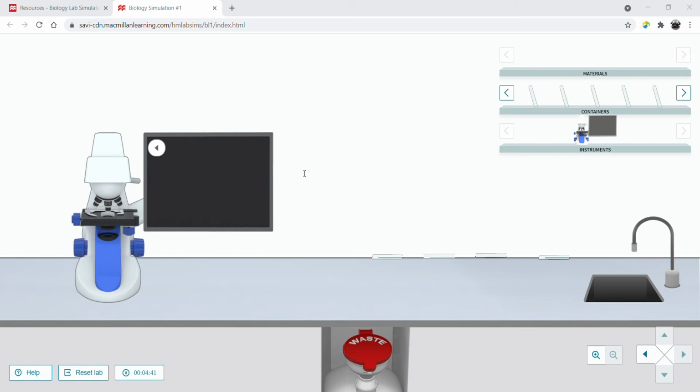Now, I'm going to go ahead and put the slides on the scope, and we'll look at the view screen to see what they have available to us. But the parts you are to label, and the images that I have of what we're supposed to look at through the virtual lab, are different. I got these off of Google Image because I wasn't able to put a screenshot of the virtual lab into the lab itself. So just so you are aware.